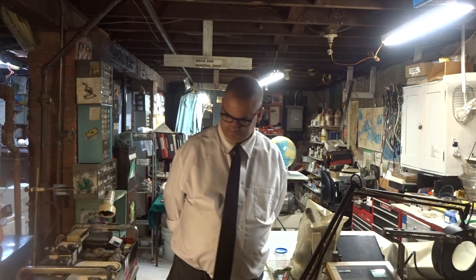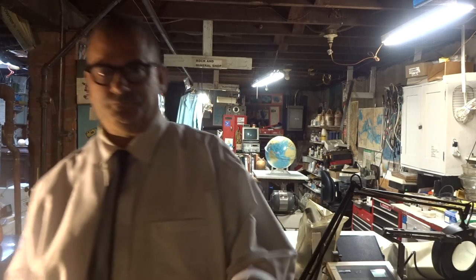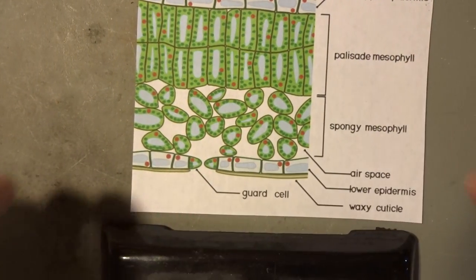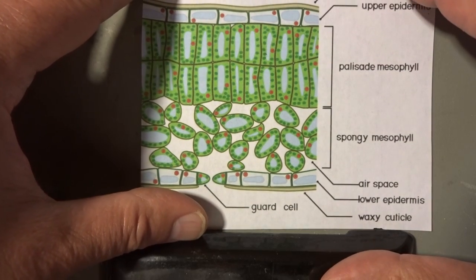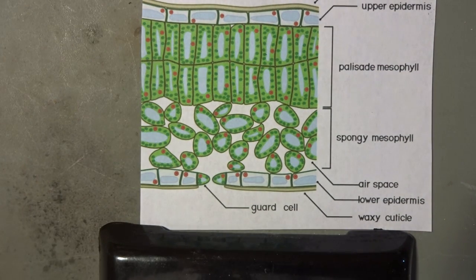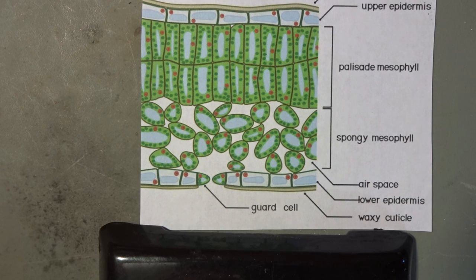Today's demonstration is on biology. We're going to be looking at the cross section of a leaf under the microscope. So let's get to the demonstration. This is a leaf cross section — a leaf is cut through into half and we're looking at the thin layer of the leaf that is cut in two, not on the surface but on the cross section.